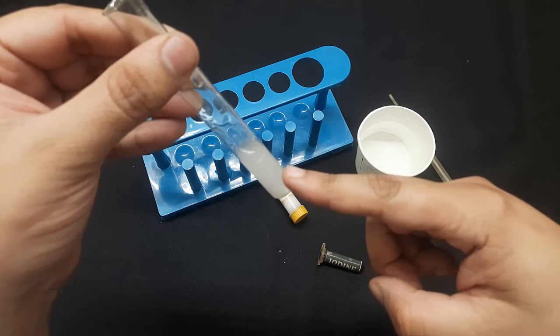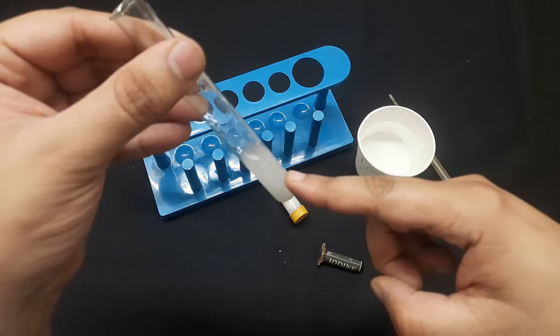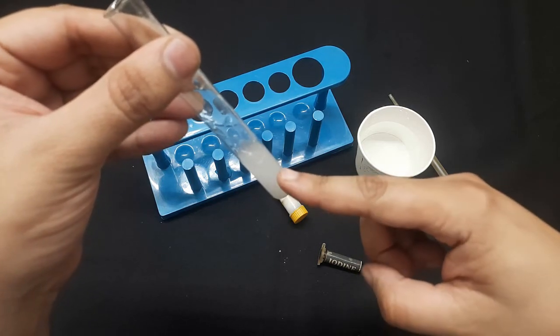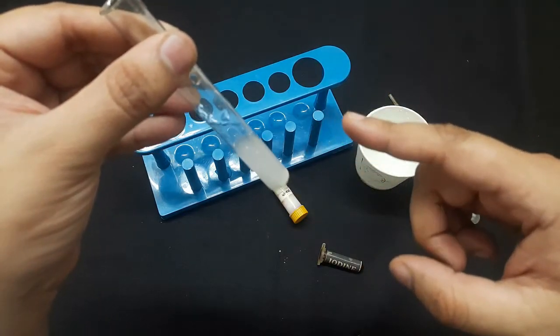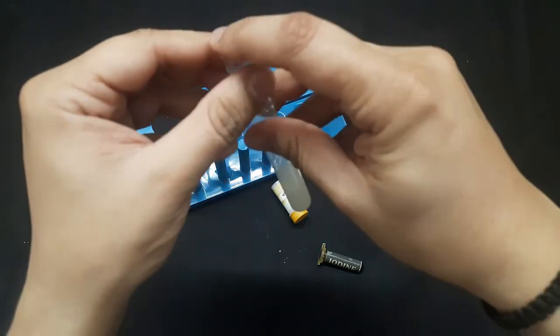If the color changes to deep blue or black, it shows the presence of starch in a food. Yes, if the color changes to deep blue or black, it shows the presence of starch in the food. So I have to shake it and mix it well.